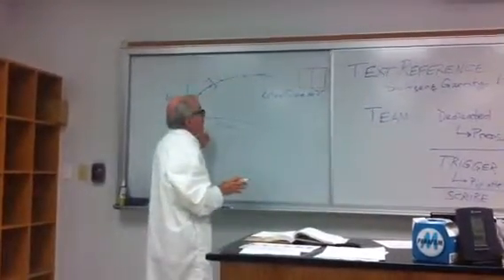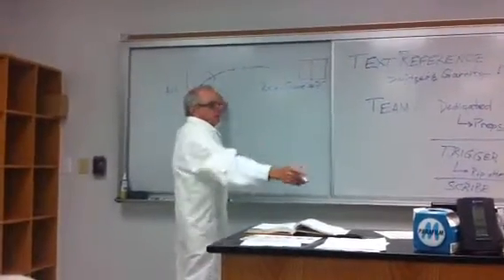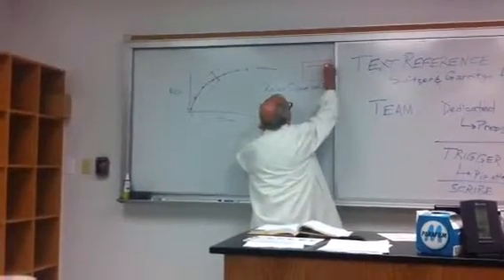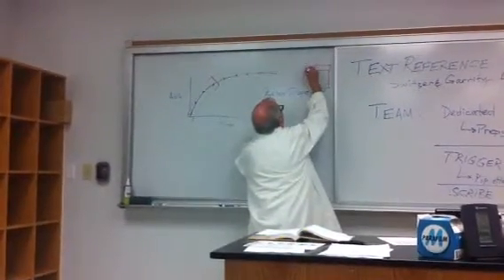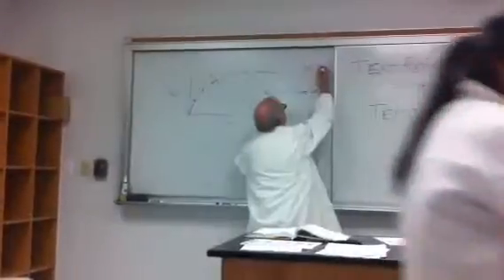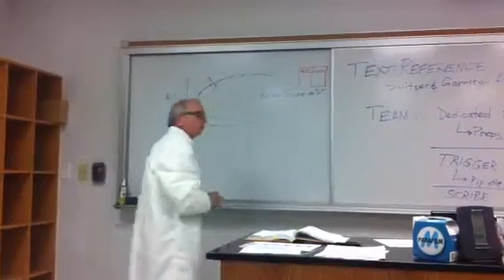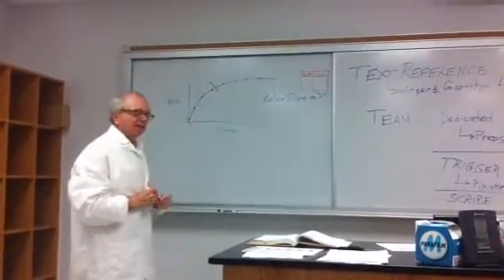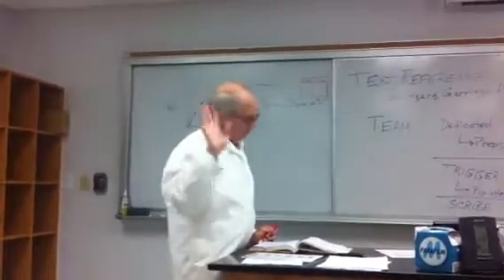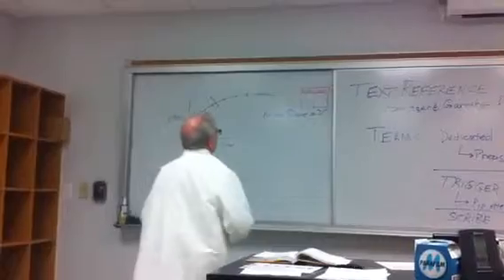So for each tube on the smart cells, you will see over here, 2.50 is tube number 2, and it will give you a rate like that. Or you can calculate your own rate. If you say, I don't like his smart cells, I don't know what's going on there, I can't see them, then just take your own data and do it yourself.